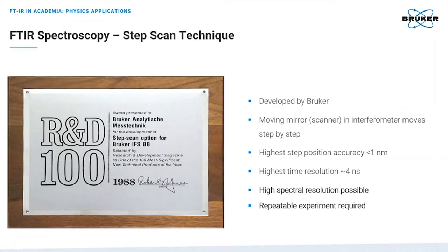The step scan technique was first commercially realized by Bruker decades ago. We may get an idea how the step scan technique works from its name. The moving mirror of the interferometer moves not continuously, but rather step by step.